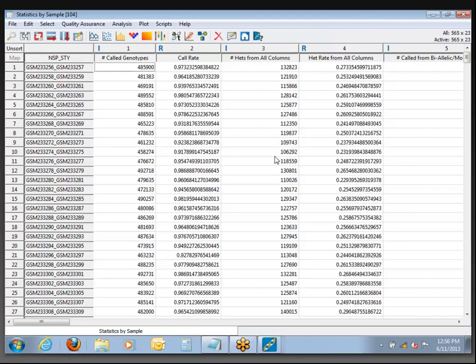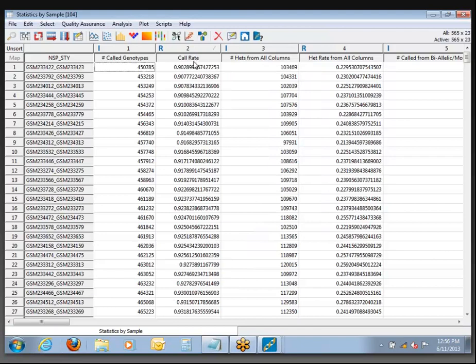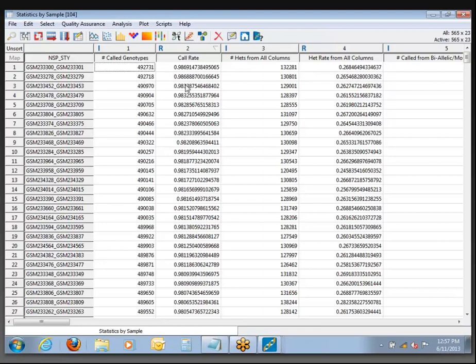You should have an output spreadsheet that looks similar to this. Column number one is the total number of called genotypes; two is the call rate. Let's take a closer look at call rate. If you right-click on this column — it is a numeric column with the R at the top — in numeric columns we get a lot of functions available, including the ability to sort. If you click the Sort button, you'll see sample call rates down to about 90%. Sort the other way, descending, and see that the highest is at about 98%.